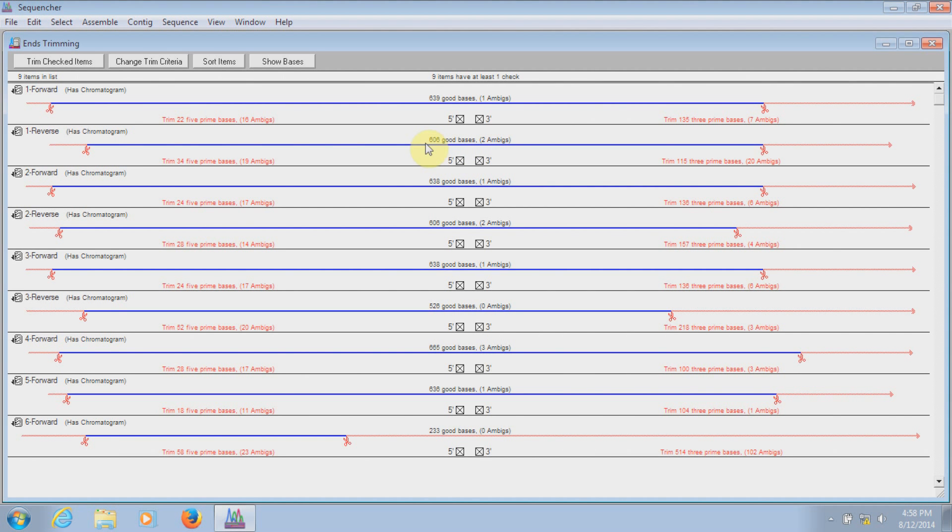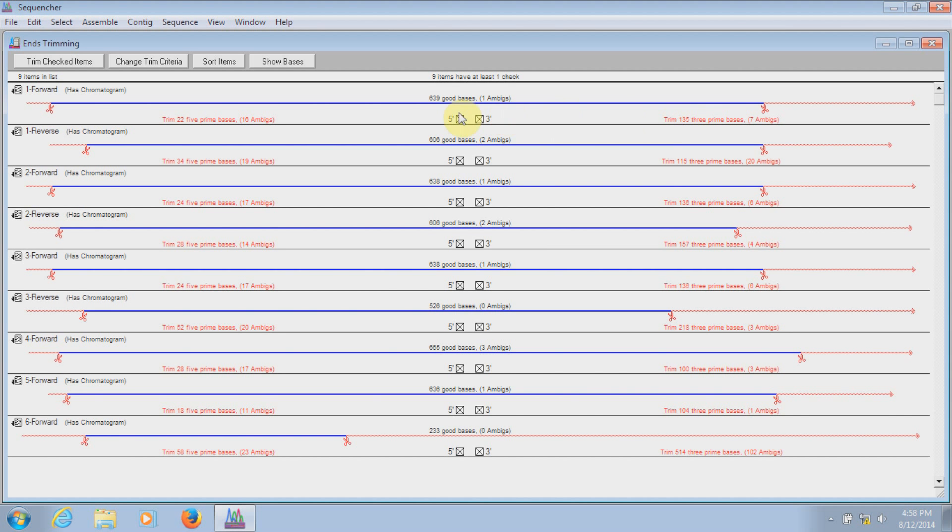Here you can see a preview of how much of each sequence will be trimmed off if I use the current trim criteria. The bases that will get chopped off are in red, and the sequences that will remain are here in blue.